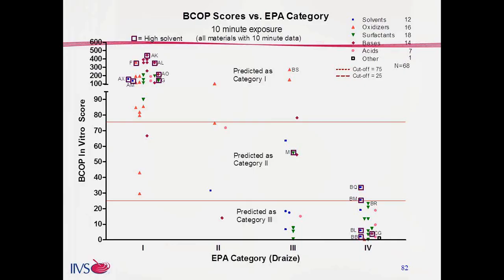Thank you, Susanna. Hans has some additional information on the use of the BCOP assay for materials falling into the category of antimicrobial cleaning products. So I'll give a quick brief on the history of this project.